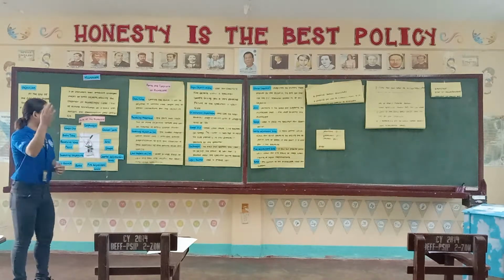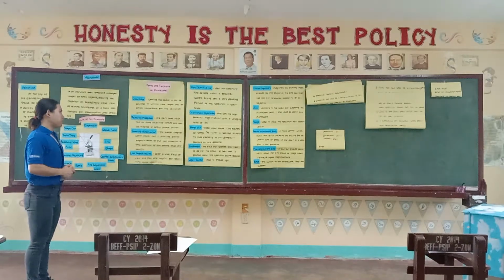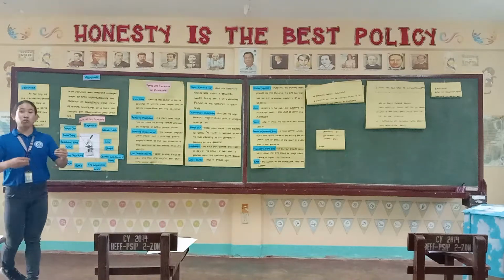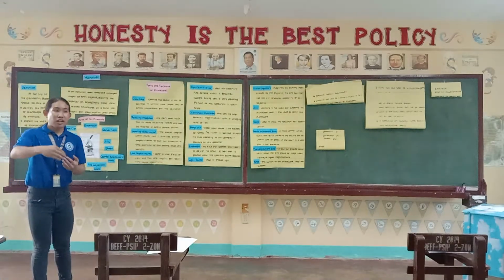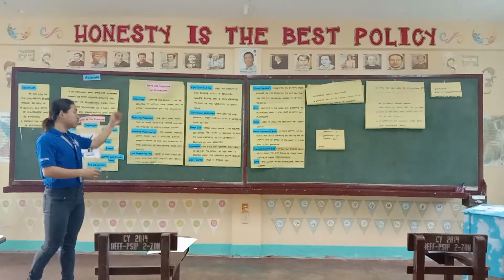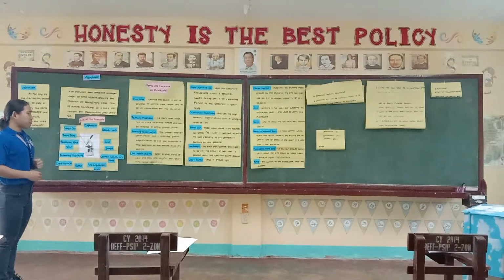It is used when there is no mechanical stage, and the viewer is required to move the slide manually to view different sections of the specimen. Meaning, ang stage clip is used siya para ma-rotate, ma-slide manually ang isa ka specimen to clearly see the total area or the total structure of the specimen. So we need to use the stage clip for us to move the specimen. So let's move on to the diaphragm.